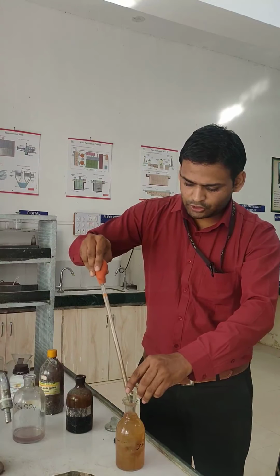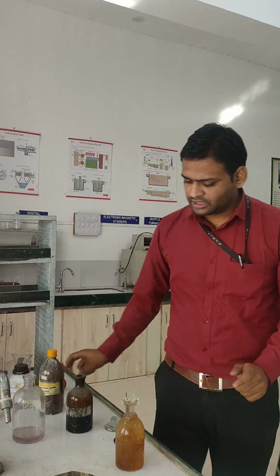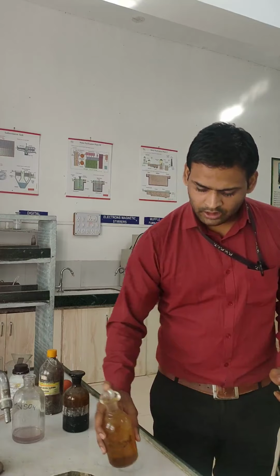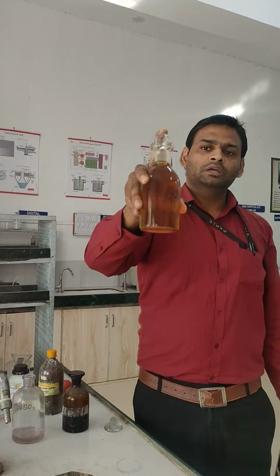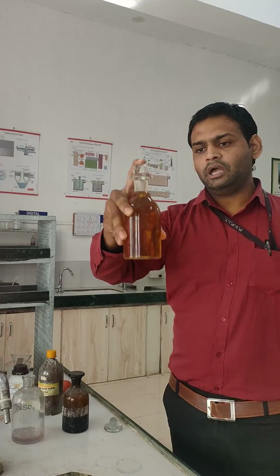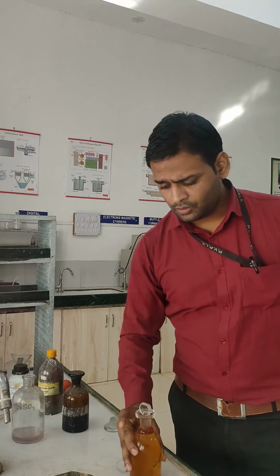After adding H2SO4, the precipitate disappears. We have to shake it properly, very well, and you will see that the precipitate that formed disappears, and this water will be clear orange water.